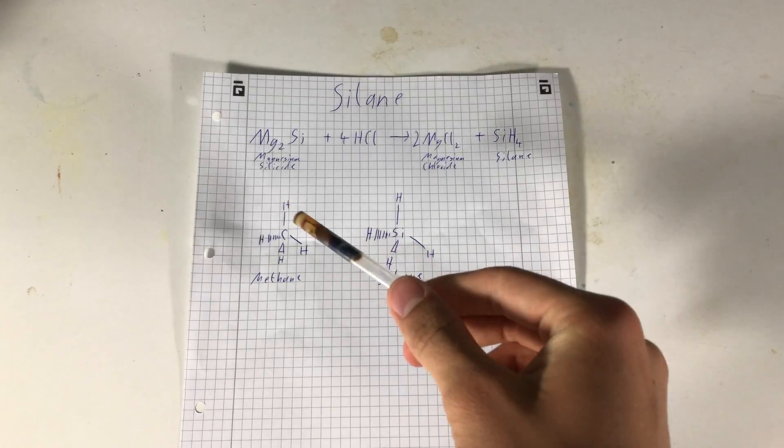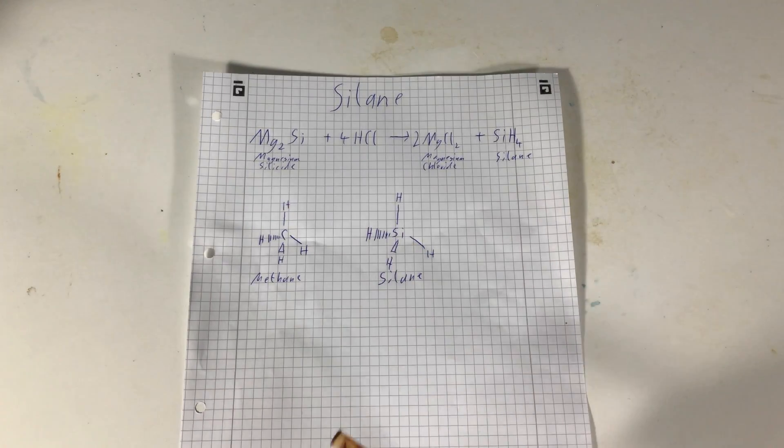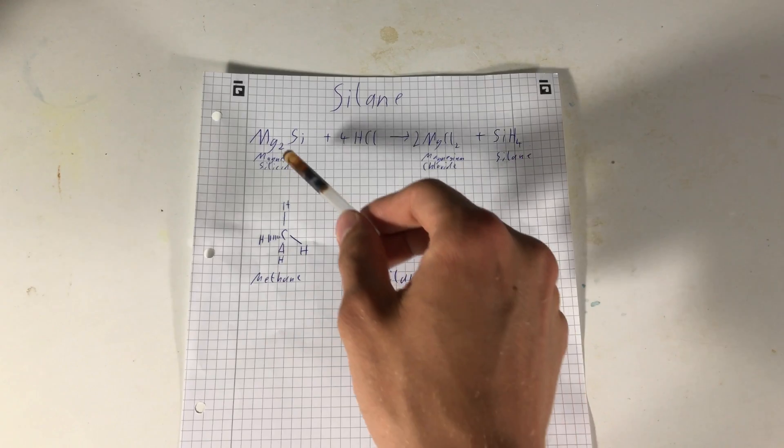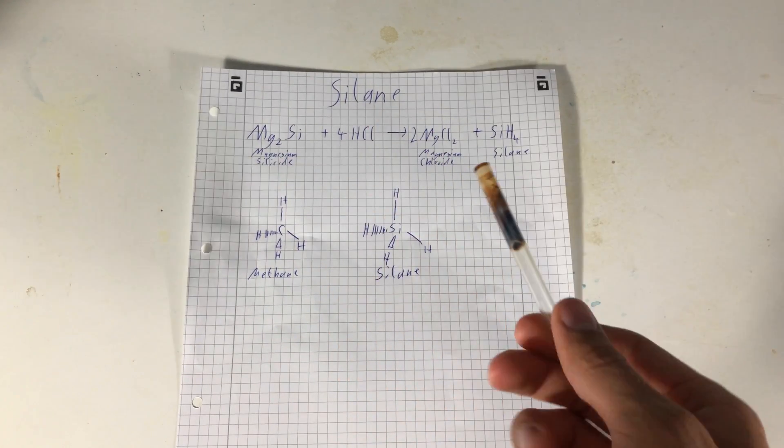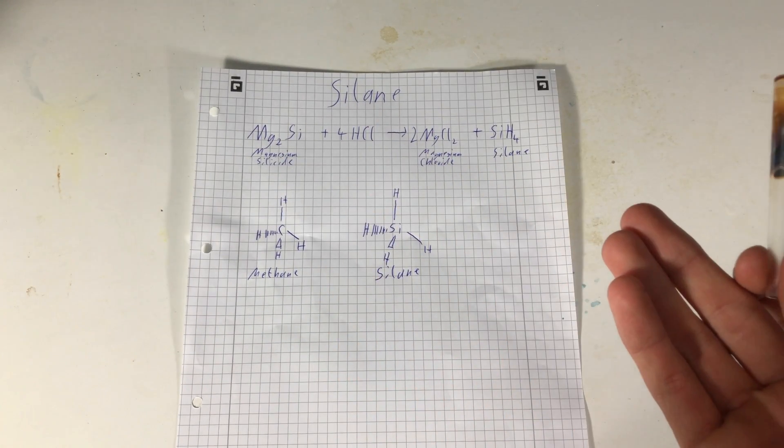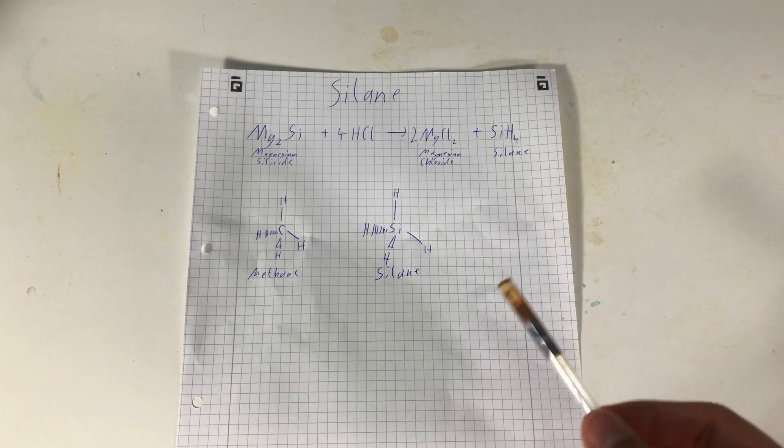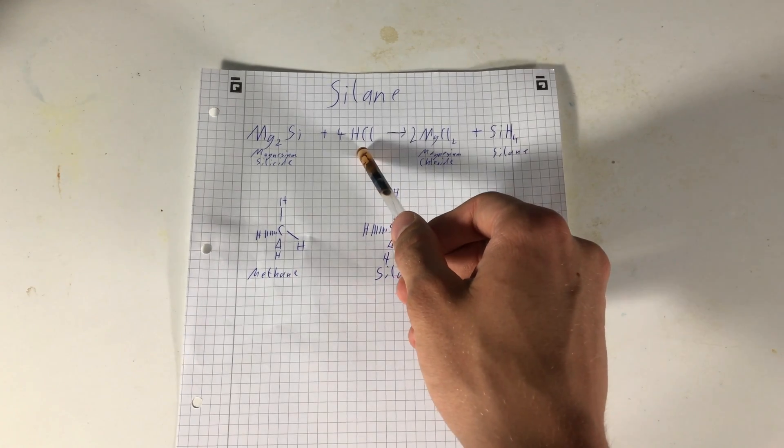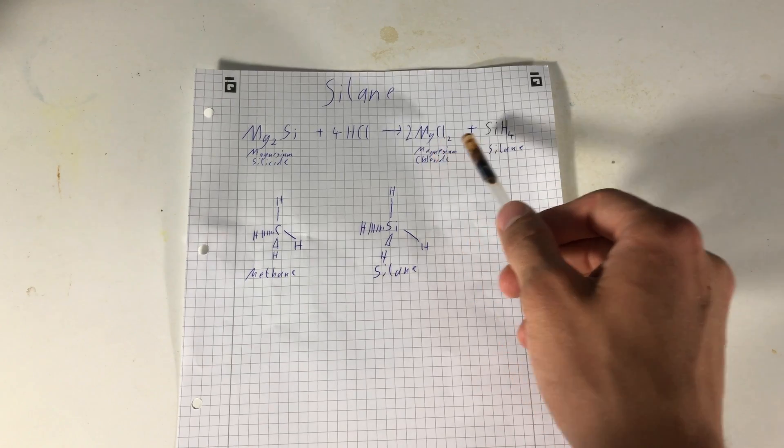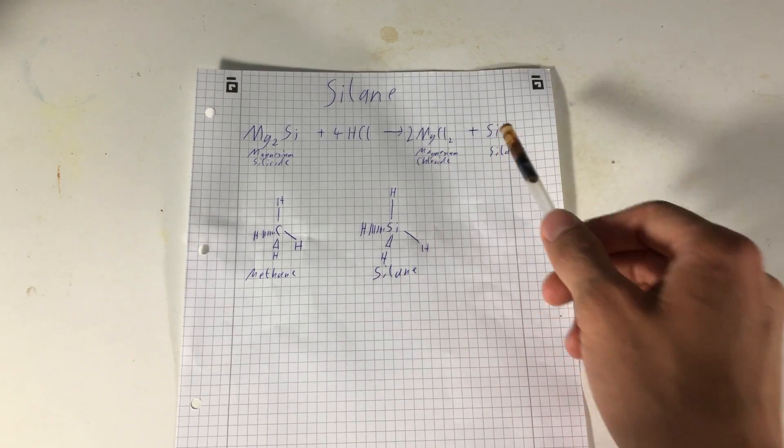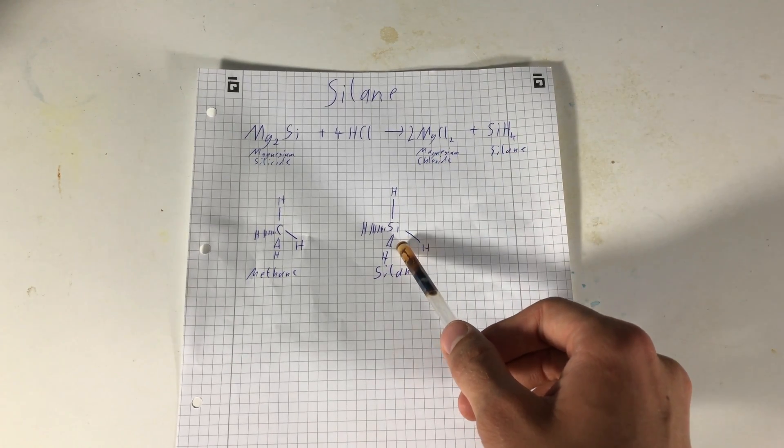Now, let's get to the reaction. What actually happened here, was that magnesium silicide, or the greyish powder in the bottom round bottom flask, reacted with hydrochloric acid to form magnesium chloride and silane gas. This here is silane.